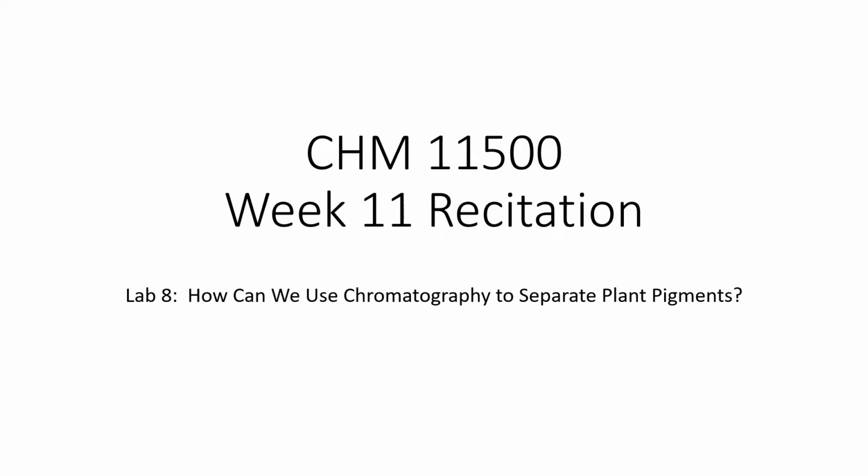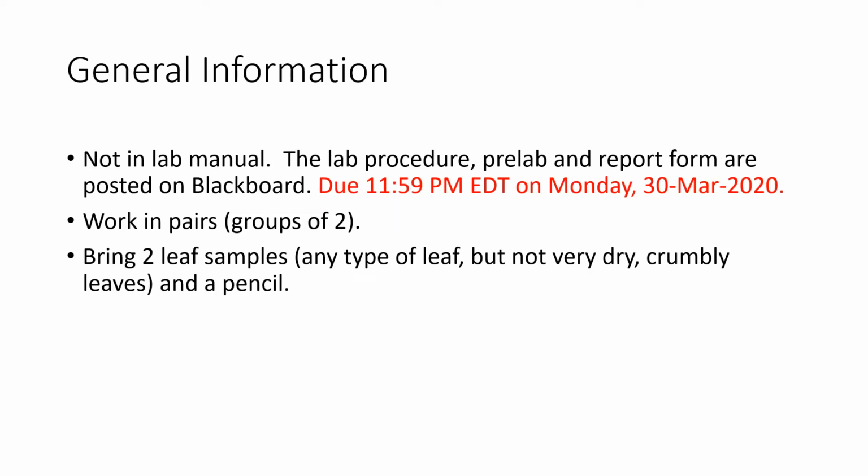This video today will introduce Lab 8, which is how can we use chromatography to separate plant pigments. Some general information. This lab is not in your lab manual, but the lab procedure, pre-lab, and report form are already posted on Blackboard in the Lab 8 folder. This lab is due next Monday, March 30th at 11:59 p.m. Eastern Time, so make sure you upload your pre-lab and report form by that time.